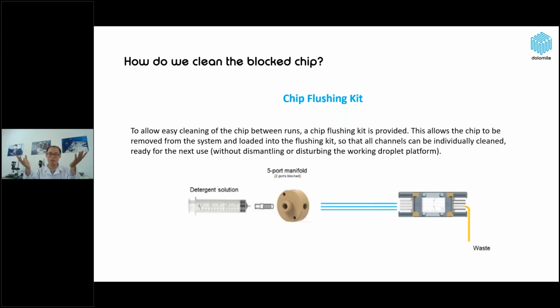So just remember to try different solvents that you think will help to remove the contaminant. And you can even use acid and base solutions, but in a different way. For the first time, just use it without the oil continuous phase. But if it can remove the contaminant and make a very small flow through the chip junctions, then you can use the continuous phase to protect the chip surface coating. Is that okay?